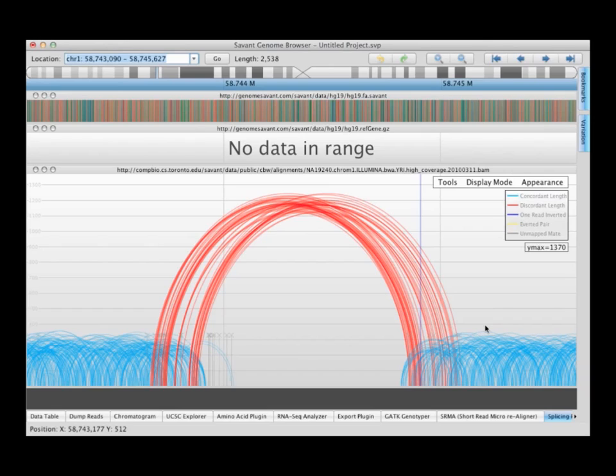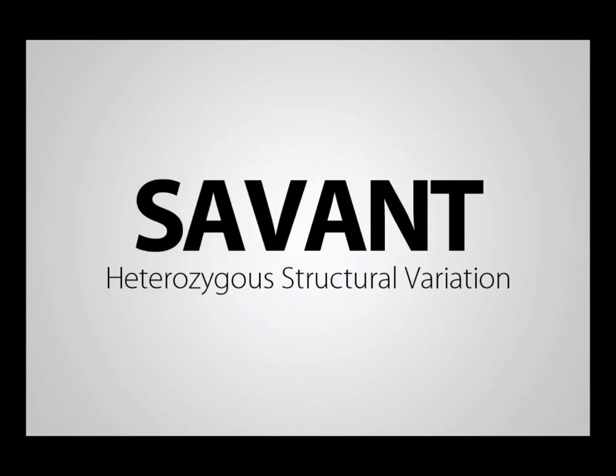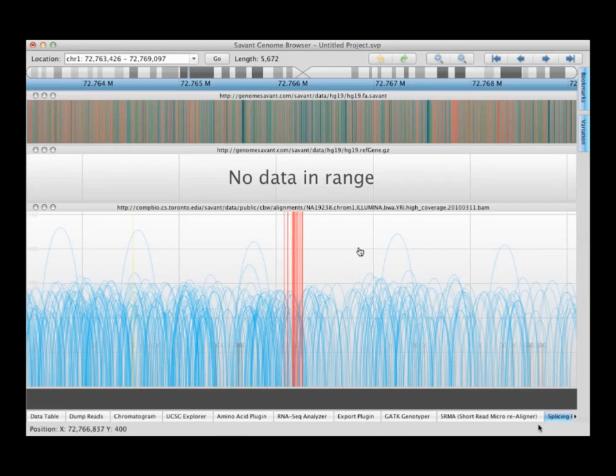These are parameterized. You have to specify to the browser what you see as discordant. It has to be based on knowledge of your library. You would know that your library has a insert size of 500 base pairs. And then you would say to Savant, anything larger than 800, for example, I want to flag that as being red.